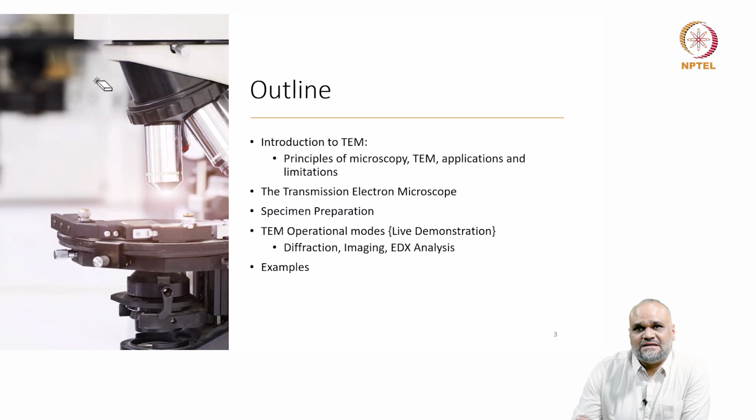When I show the TEM, I really want to go next to the instrument, show you what the individual components are, how the instrument functions, what are the different changes that we do, or what are the procedures that we use to start obtaining an image. I'll go through all the basic modes.